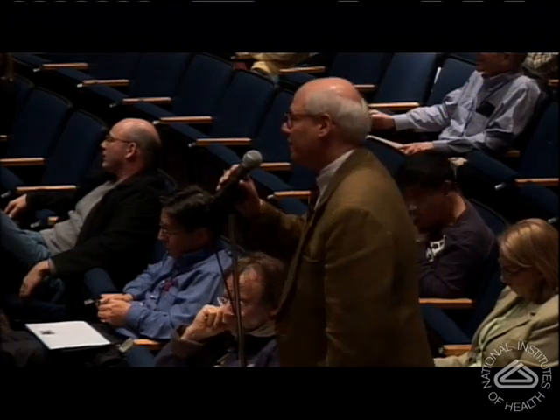Well, I actually think Mark Knepper here, who just asked a question, is probably a much better expert on urinary proteomics than I am. We are doing urinary proteomics as part of our molecular epidemiology infectious disease proteomics project. Urine is a good source for markers, but it has a lot of complications relative to plasma or serum. One of those is the very high degree of variability in the absolute abundance of proteins in the fluid and the relatively low overall content of proteins. So there are technical issues from a processing standpoint, but if you're looking at diseases of the kidney, then I would think urine would be a terrific starting point.